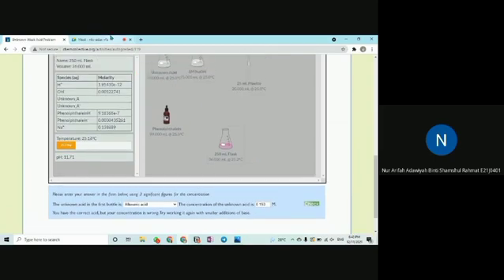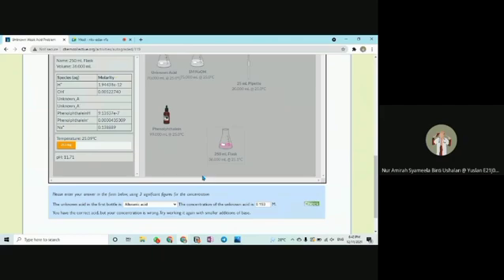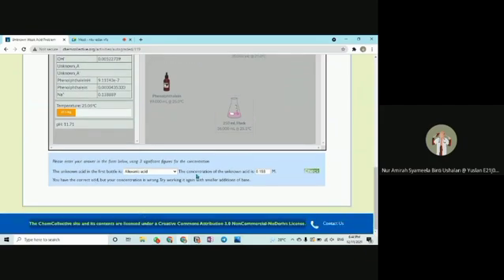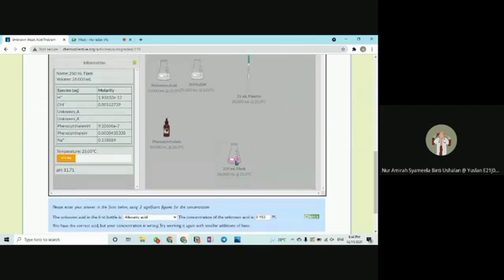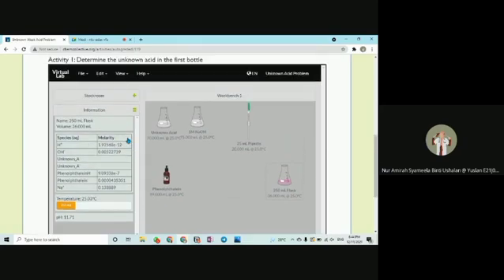Next, I will pass to AMIRAH. Assalamualaikum, my name is AMIRAH. Okay, as Arifah mentioned just now, we already did this experiment earlier and did the calculation, and so far we received the alloxanic acid, which is correct, but sadly our concentration is wrong. In order to fix that, we have to restart the procedure, but this time we have to be more precise and try small additions of base.